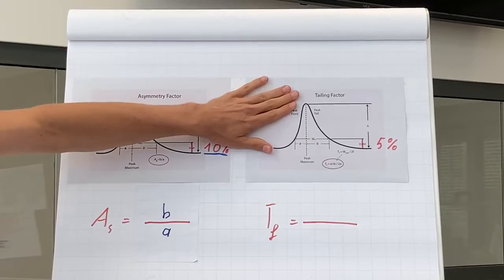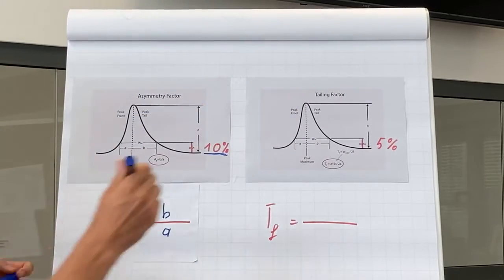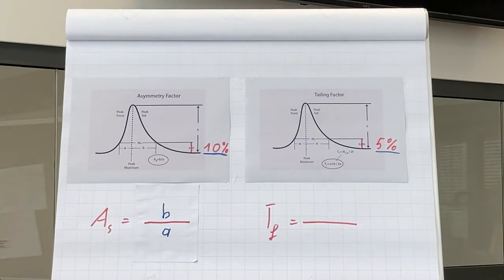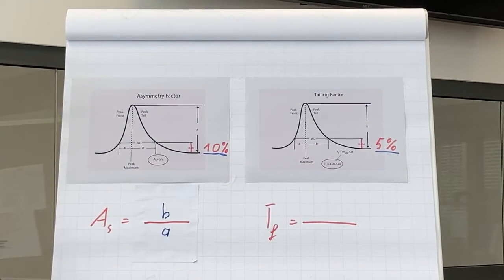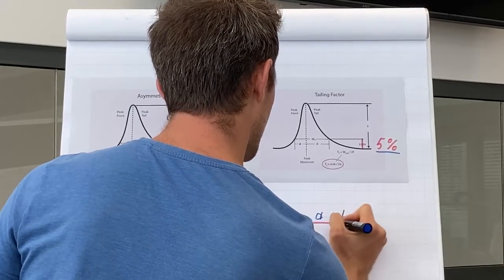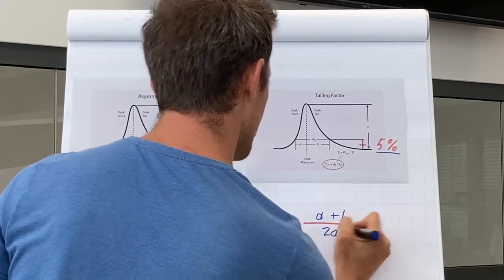The tailing factor is measured at 5% peak height and is calculated with the following equation: A plus B divided by 2 times A.